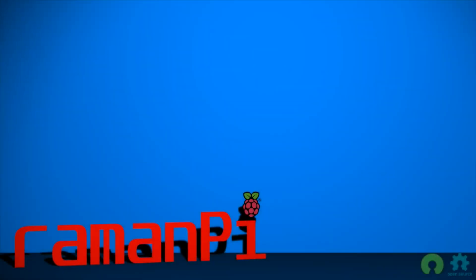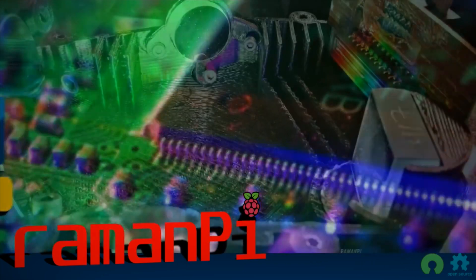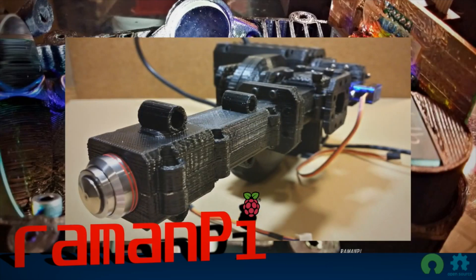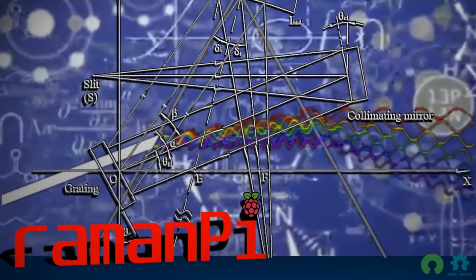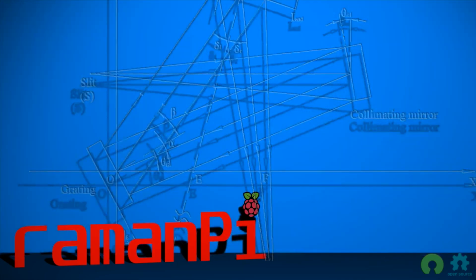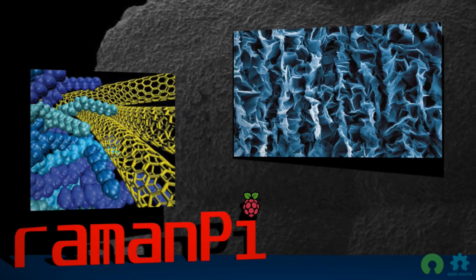Raman Pi is a benchtop Raman spectrometer constructed from very easy to source components and 3D-printed parts, capable of being printed on even entry-level printers. Complicated physics aside, Raman Pi provides valuable information about a wide range of materials.